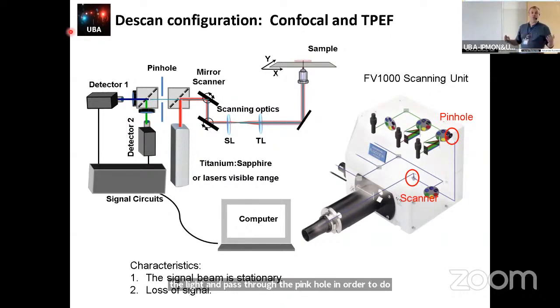This is the regular way that all confocal microscopes work, and then, if you want to have more than one channel, you can use another dichromatic mirror, or you can use some other strategies like an acousto-optic modulator, AOTF, etc., that enable you to collect different ranges.